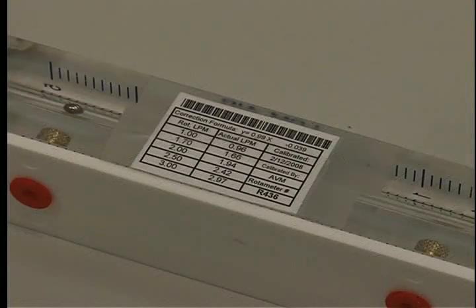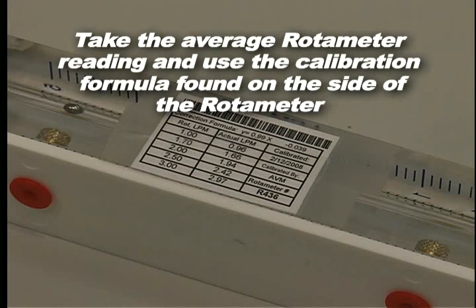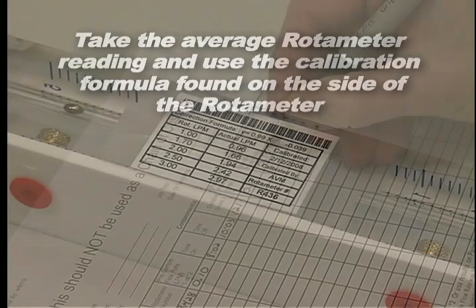All rotometers are calibrated against a primary standard quarterly. This calibration formula is located on the side of the field rotometer. Take the average rotometer reading and plug it into the calibration formula found on the side of the rotometer to determine your actual flow rate.